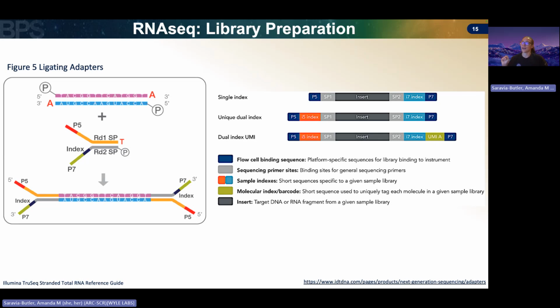So this is going to help us identify technical duplicates when we go to the next step, which is our PCR step. And we'll see why technical duplicates can be a problem when you take the RNA-seq omics module set. So just importantly, this UMI is added before the final PCR step, and it's going to be unique to each sequence.